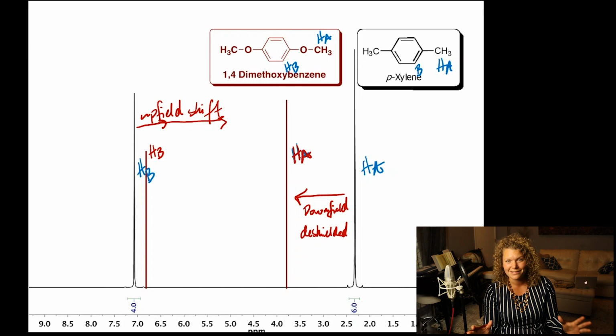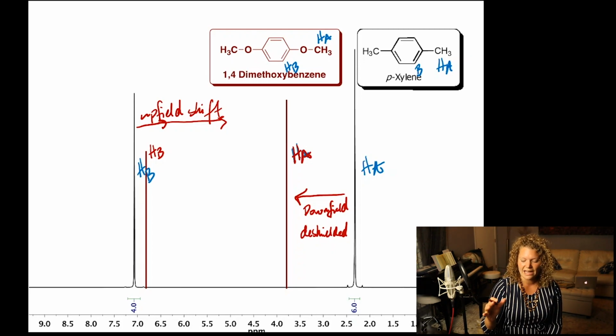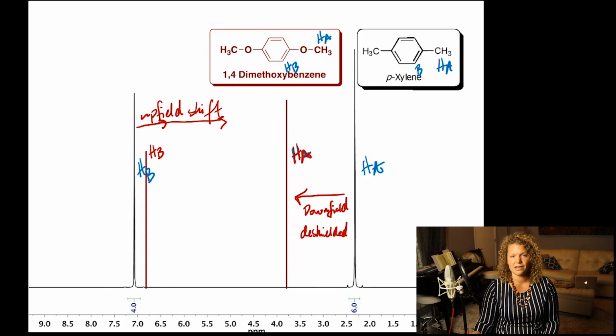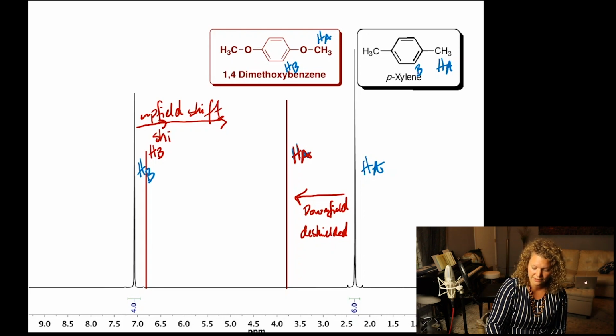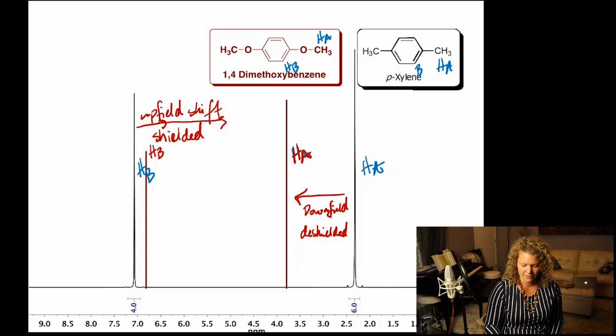This is why I love resonance. We can really describe a lot of things with this. In this case, when an oxygen is bound to an aromatic ring, it shows that the protons of the aromatic ring are more shielded. See the difference? Alkyl versus this aromatic ring.